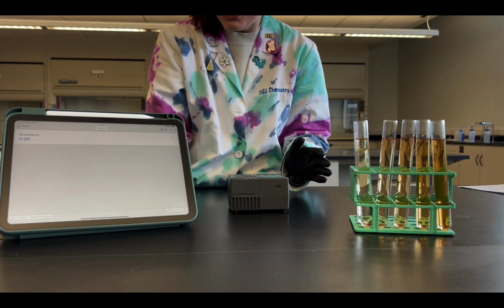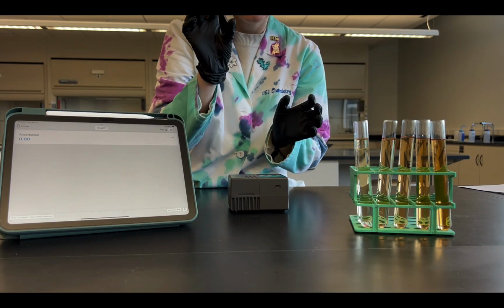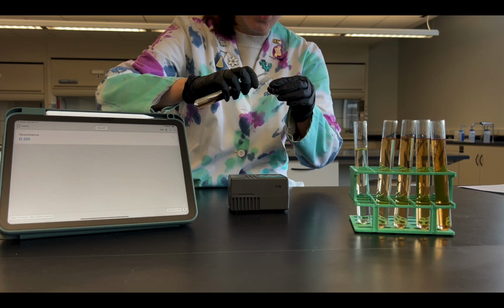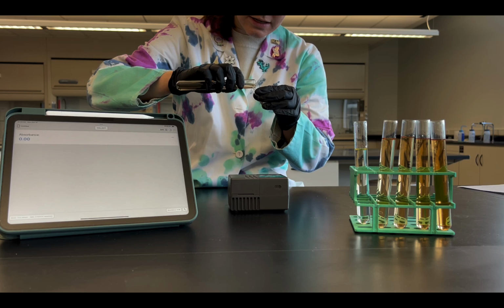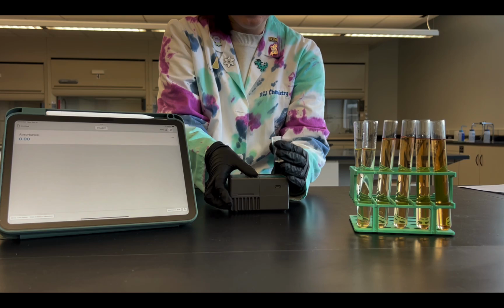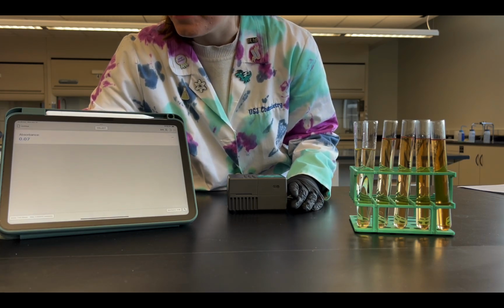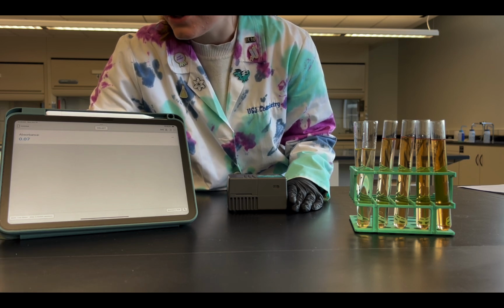So what I'm going to do next is take each of my test tubes here, pour it into the cuvette, put that cuvette into the colorimeter, and record its absorbance. So here's test tube 1, which is our lightest solution, so it should be the lowest in absorbance. We can start to see that my absorbance is going up a little bit. Sometimes it takes a little bit to read through, but it's about 0.0607.